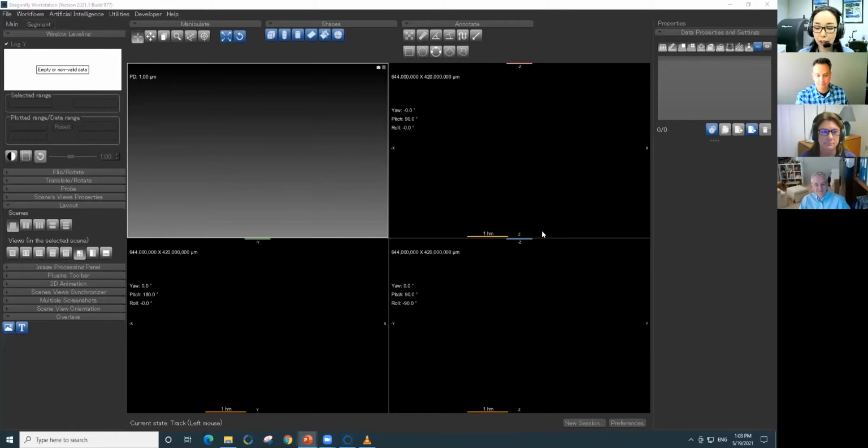We will take a look at a couple of different scans today, but let's start with something simple. I'm going to load a CT scan of a pecan nut. But before we do this, Angela, let's ask the audience what we need to know when loading a scan into an analysis program.